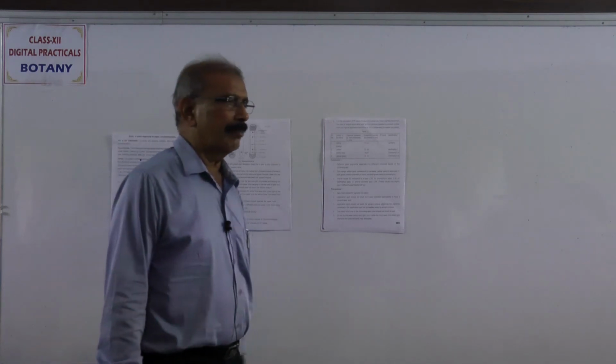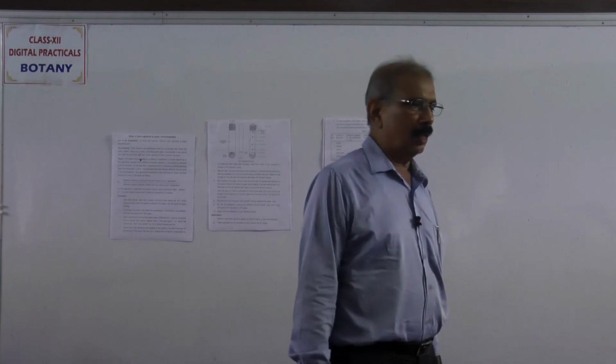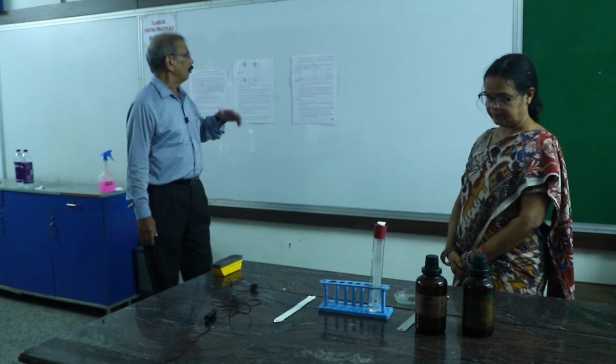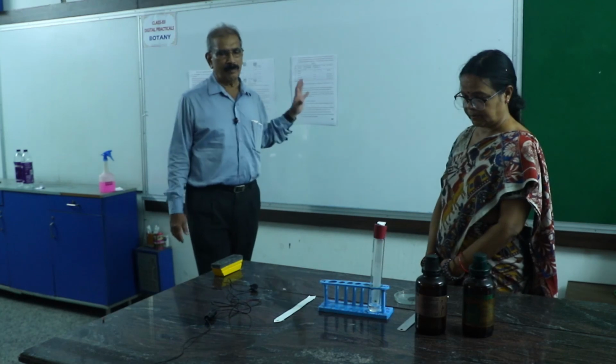The color fades, that is, it fades away. Then you have to write the precautions, and you have to write in this way. This is the chromatography experiment.